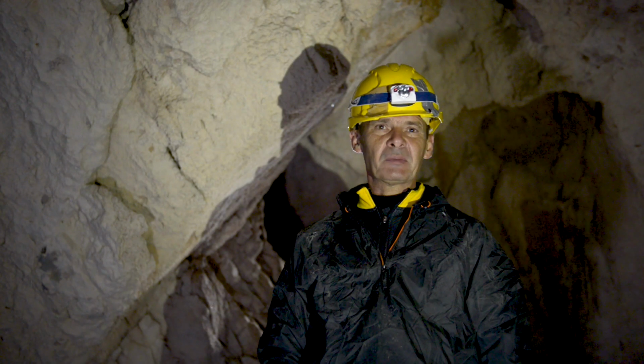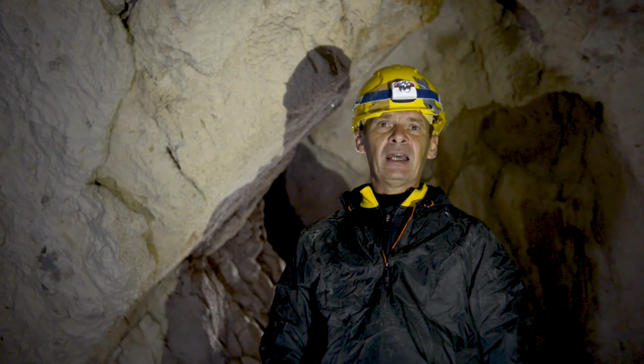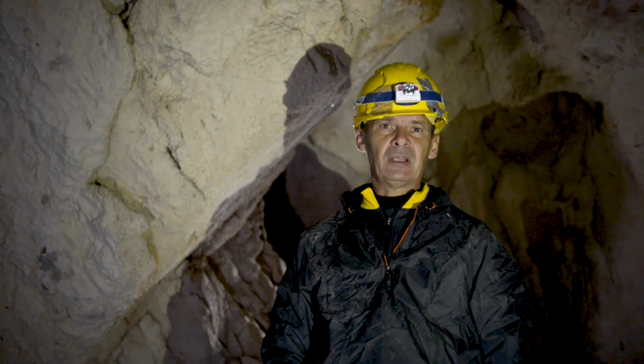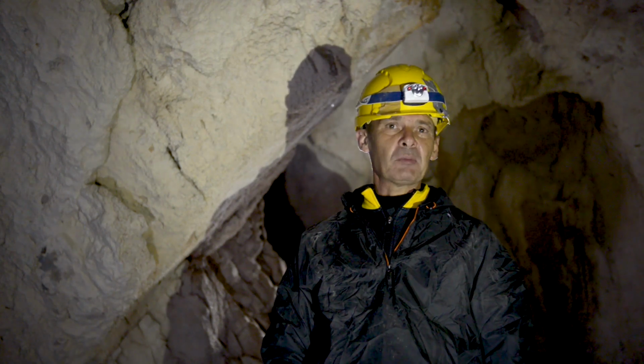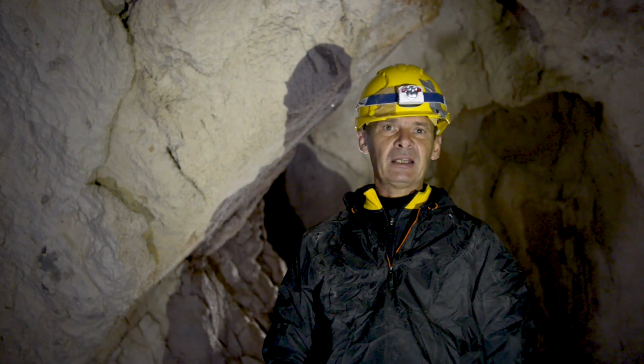We couldn't bring a PCR machine and so on. We have been able to bring the Voltrax and to sequence insects that the speleobiologists have found here. And the laboratory was run by citizen scientists. So this technology is not only very mobile, it's also very simple to use and can be used by anyone now.